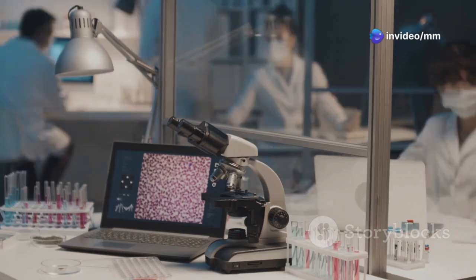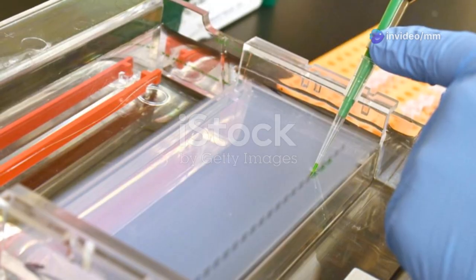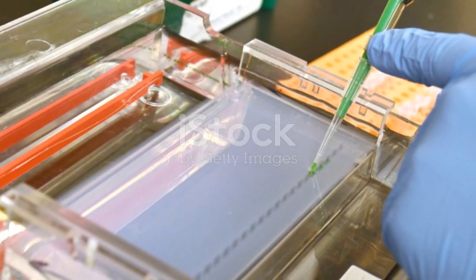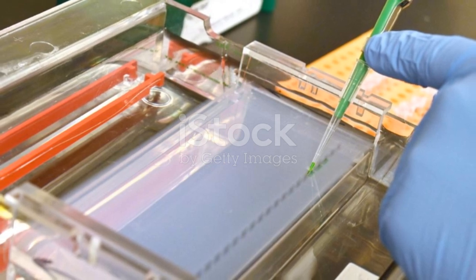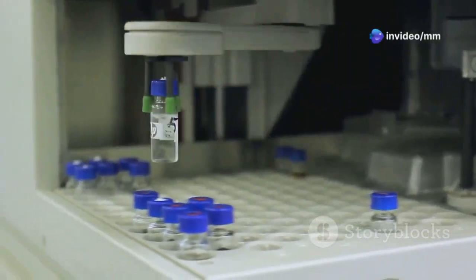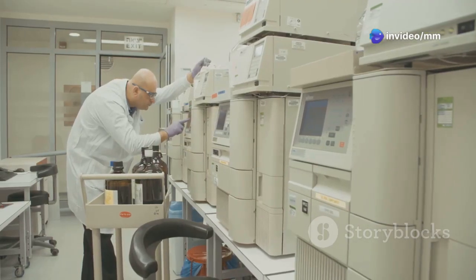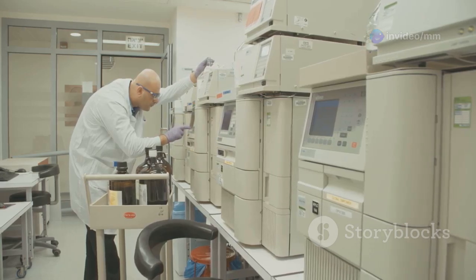Section 4, from gels to machines, automating the process. While manual Sanger sequencing using gels was groundbreaking, it was time-consuming and labor-intensive. Thankfully, technology has advanced, and we now have automated Sanger sequencers. These sophisticated machines streamline the process, allowing us to sequence DNA faster and more efficiently.